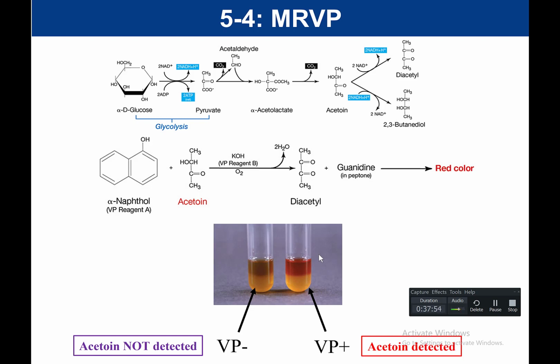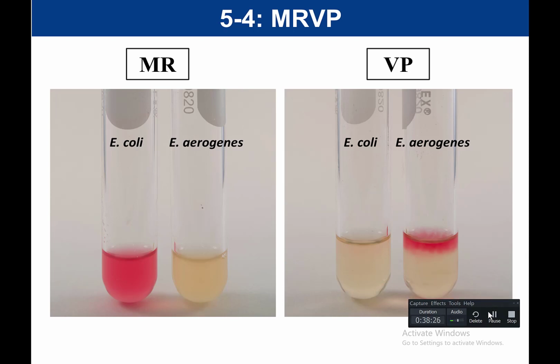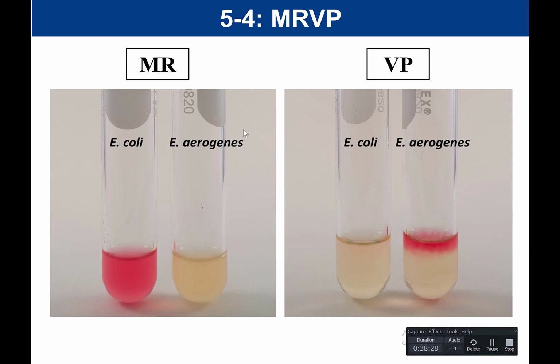So again, like methyl red, red is positive for the VP. So in this case, if it turns red, that means that acetoin was detected and that organism is VP positive. If the tube is not red, then that means that the acetoin was not detected and this organism would be VP negative. It does not produce acetoin. So let's look at our results for this experiment for the organisms that we're testing.